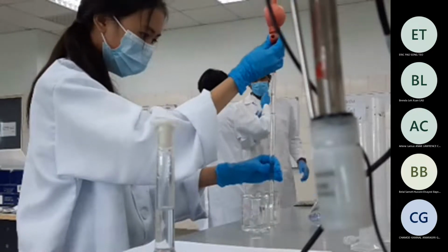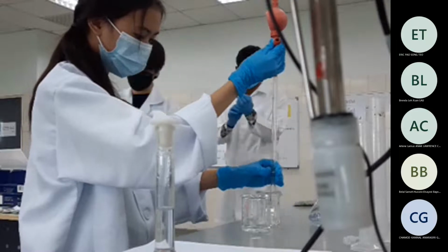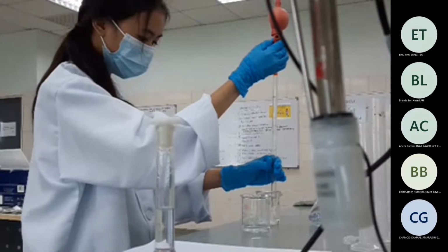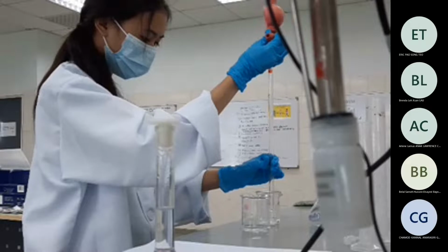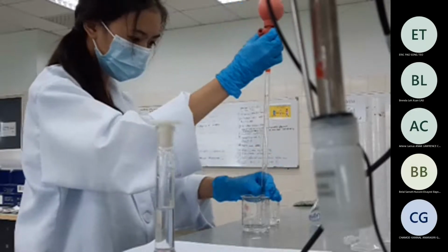Yeah, it's considered mixed because they are readily mixed with water. So we do not have to do it vigorously, but to some extent we shake it so that it mixes. So fill it until here. Yeah. After that. Yeah.